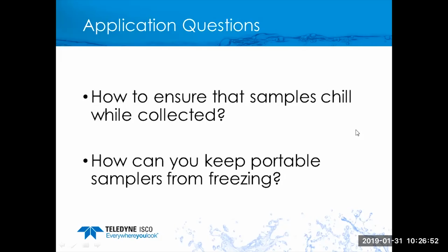How do you keep portable samplers from freezing? And a related question just came in. Are there any freeze protection recommendations for the 37 or 6712s when set up in a remote location? No shelter housing available, operating off a battery.